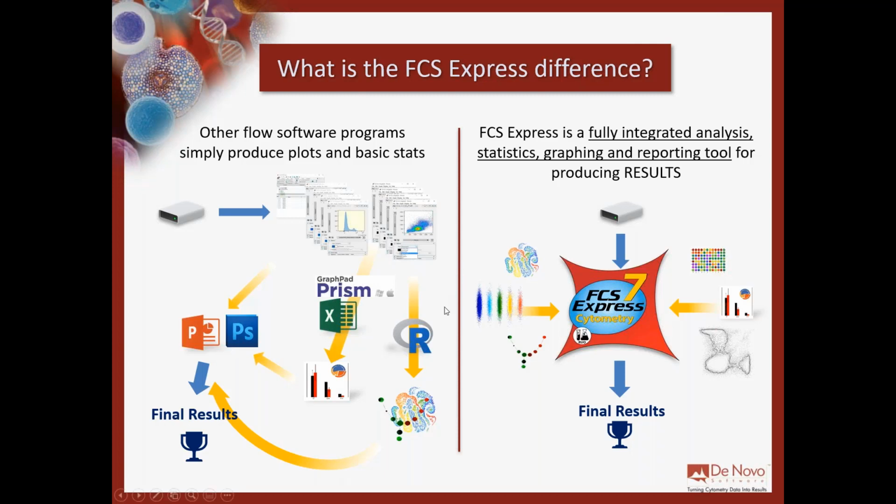And what about when you want to perform some more complex analysis, like high dimensional data analysis? Well, usually you need to rely on statistical software, or maybe your software can do that, but it relies on plugins that are not always working. Maybe you cannot install them, and so on.